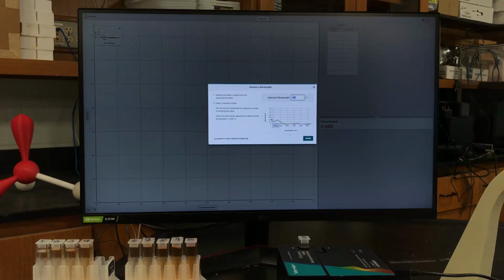And we can see that little absorption spectrum here. I'm going to move this slider over to best see. It looks like 452 is the peak absorbance here. So we're going to set the spectrophotometer to peak absorbance. I already have 450 there done. Okay, it already set that for me. So it's very important to understand that we're going to set the spectrophotometer to look at peak absorbance. And so we'll do that there.